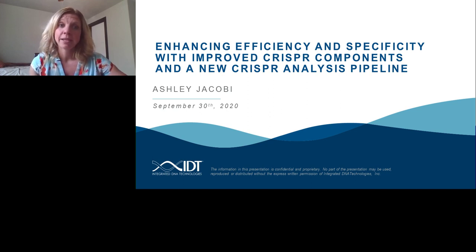Today, I'm excited to present some of the new work our team has done in the CRISPR space, specifically focusing on some reagents that we've developed to enhance CRISPR efficiency and specificity, and then to showcase a new CRISPR analysis pipeline that we've developed that we hope to release out to the community soon.